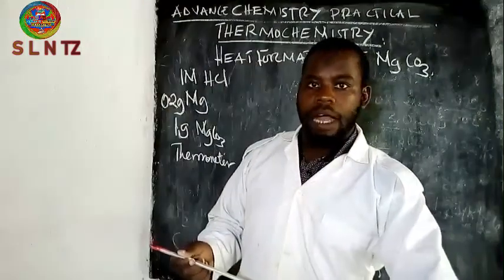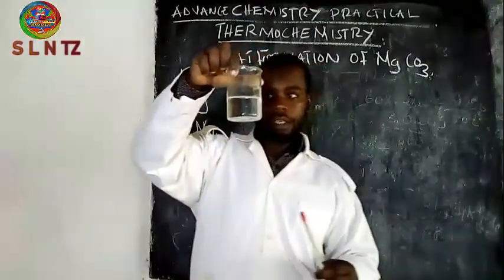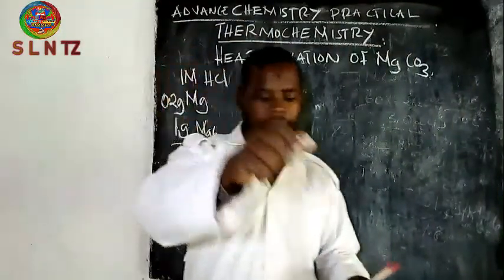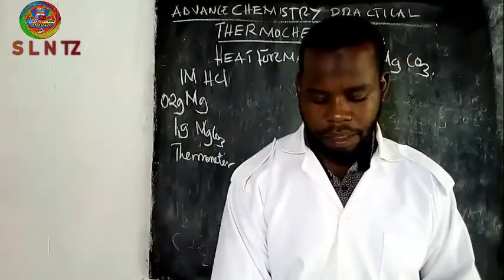Also, we have hydrochloric acid solution, as I have said, 1 molar. And I also have a measuring cylinder. Those are our apparatus.